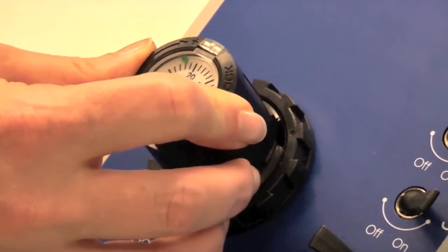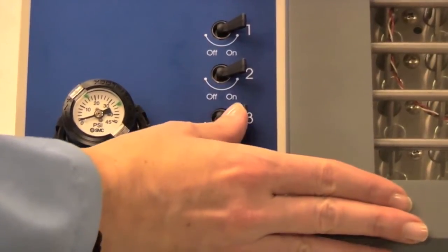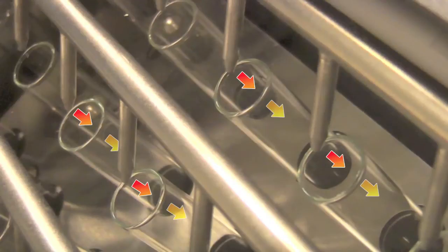By using a gentle stream of nitrogen and heat, samples can be concentrated to dryness or a desired endpoint.